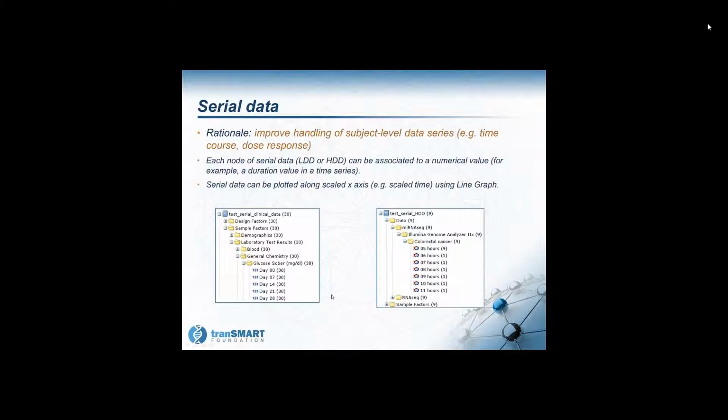And it's taking a little while. So here is the heat map into subsets. Yeah, now we see the heat map and hierarchical clustering on the RBM data across all the samples.